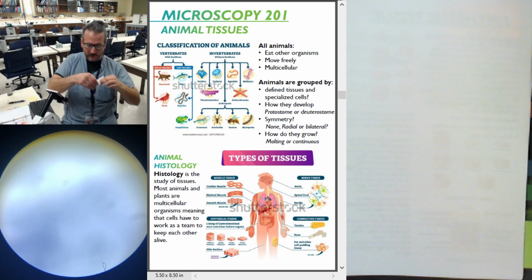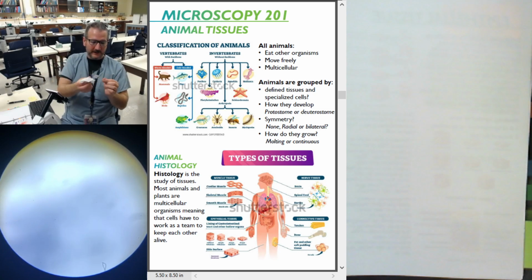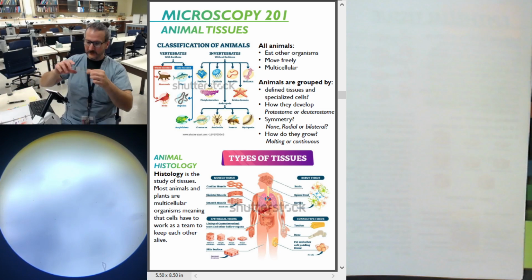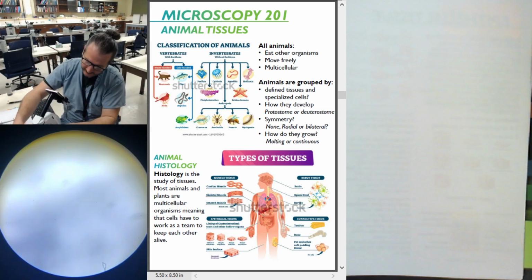If the prints and the dirt weren't coming off, I would take a little bit of eyeglass cleaner that you can buy at the dollar store for a squirt bottle for $1, or go to like a Walmart, go to their lens center, the glasses center, and just buy a nice bottle of squirt eyeglass cleaner. Yeah, that looks great. You can see my fingerprints over here, but not on my slide again.